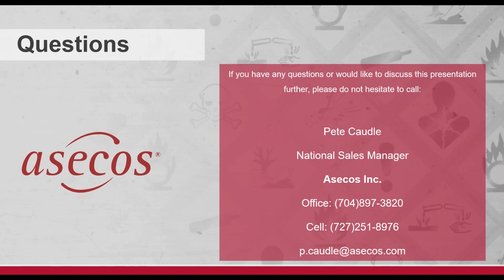Yeah, that's a good question. I don't really know a good answer for that. But to me, if you're going to put a cabinet there, I would ventilate it itself. Okay, great. Perhaps a comment from Dan Curley here. My understanding is that the fire code in Ontario requires that the ventilation from a cabinet cannot be connected to the general exhaust / fume hood. So perhaps this is to your comment on authority having jurisdiction that would dictate how this should be approached. Is that something that sounds about right to you?